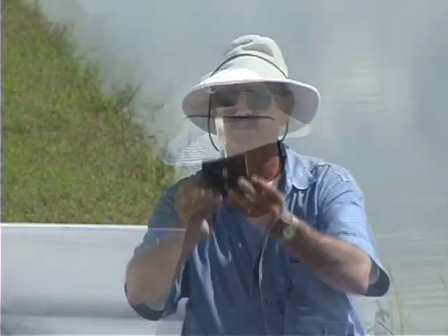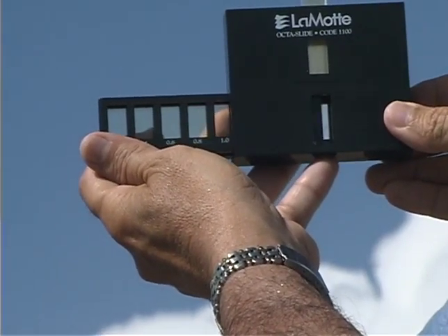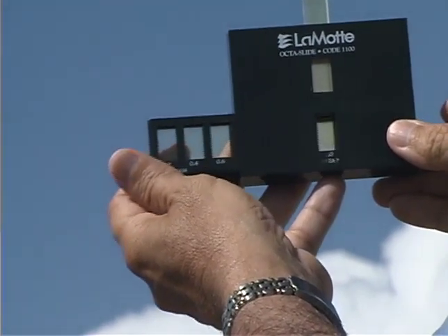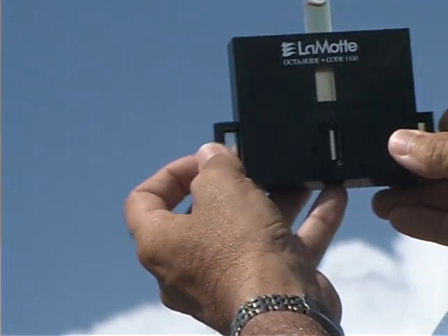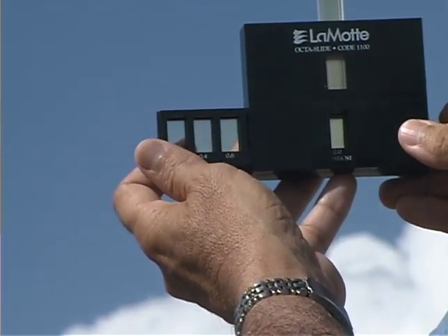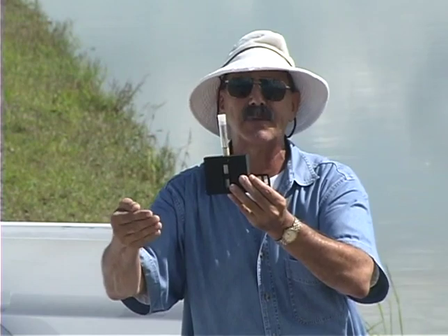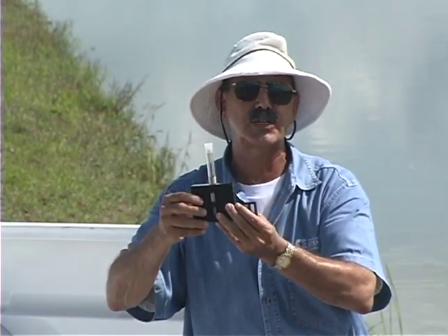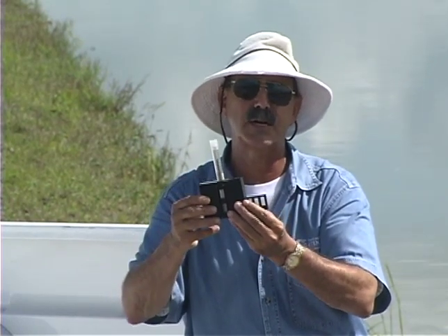So we wait 5 minutes. As we had hoped, diluting this water sample did allow us to read the total ammonia nitrogen concentration in this sample. We diluted the sample 50-50 with deionized water, so our 2.0 reading will be multiplied by a factor of 2, giving us a total ammonia nitrogen concentration in this pond water, at 9 o'clock in the morning, of 4.0.